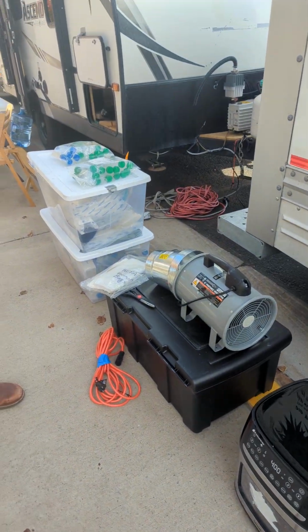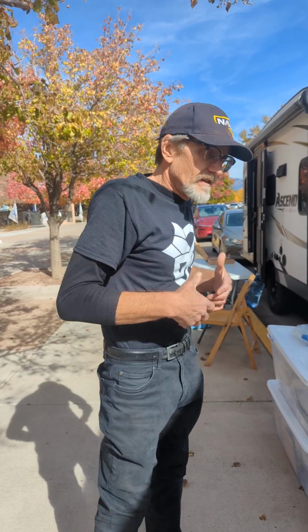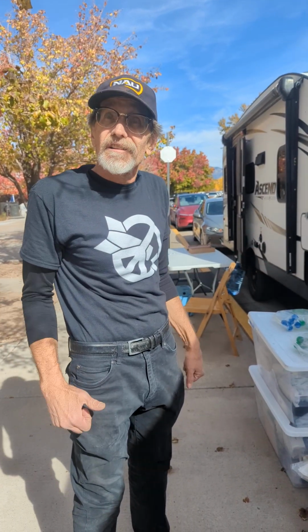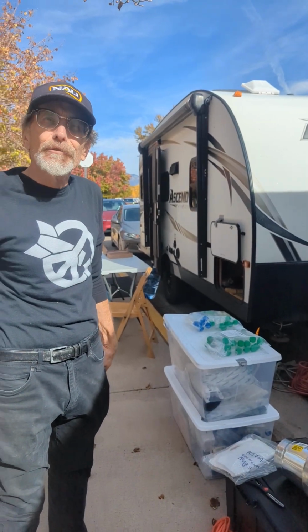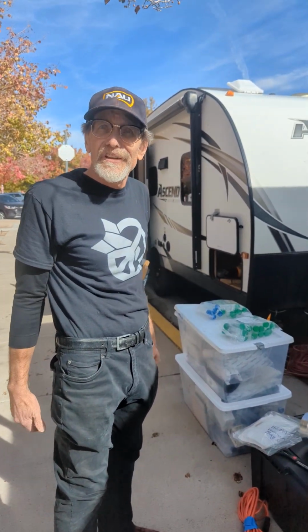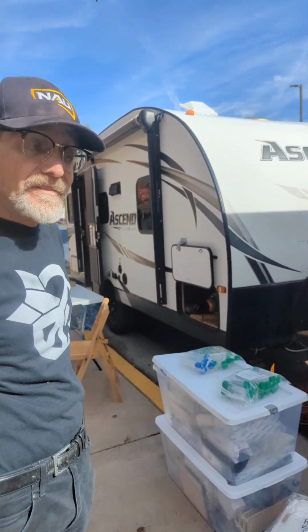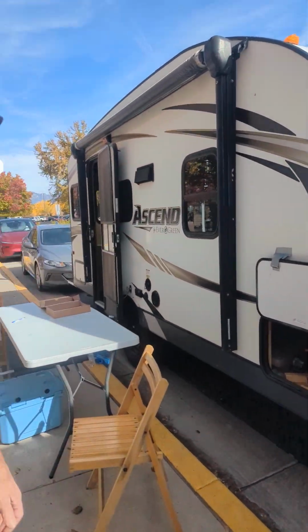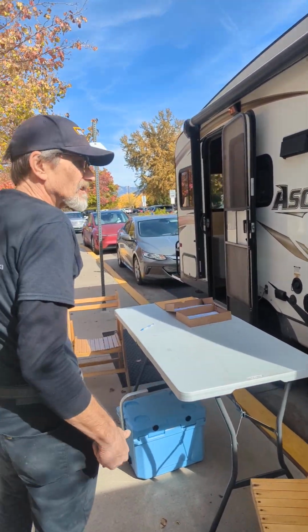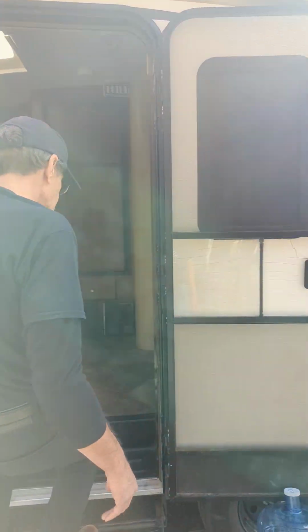The overall purpose of this device is to test water, air, soil, environmental media for contaminants that are really related to RECA, the Radiation Exposure and Compensation Act. Uranium and plutonium are two of the things that this equipment can test. The device that's inside is called an inductively coupled plasma mass spectrometer. Let's step inside and see that, and then I'll explain the rest of it.